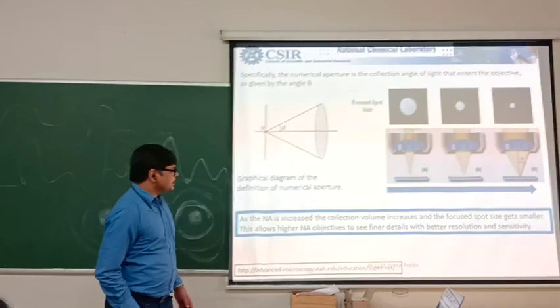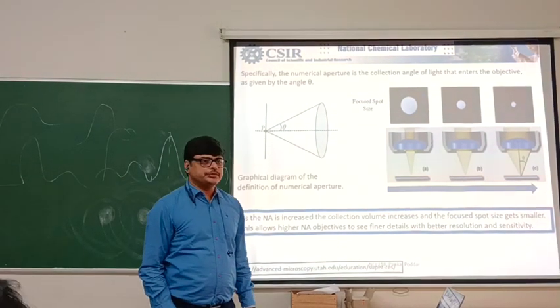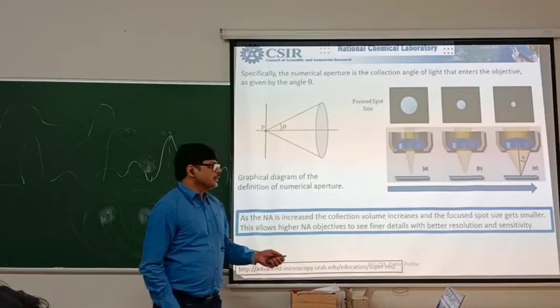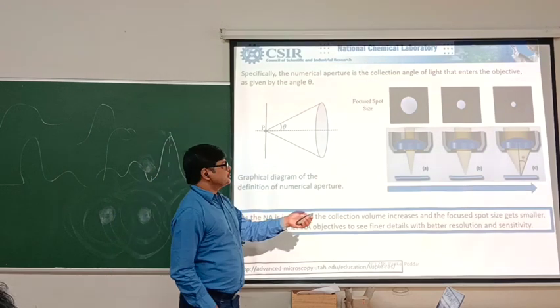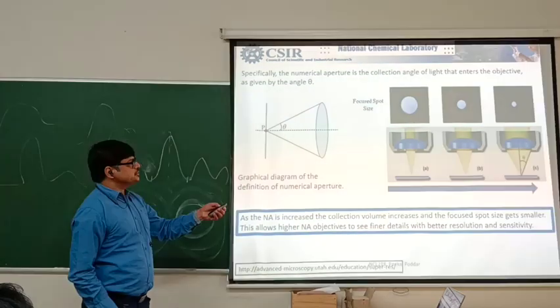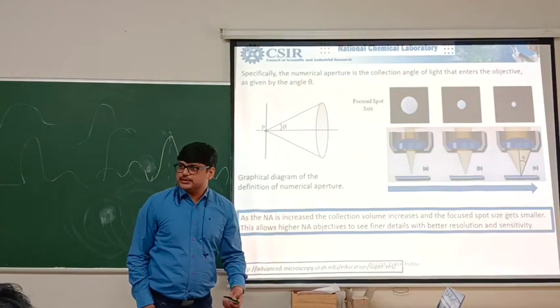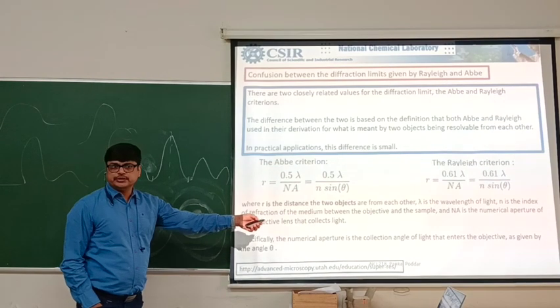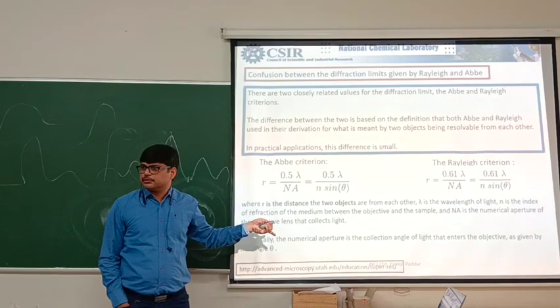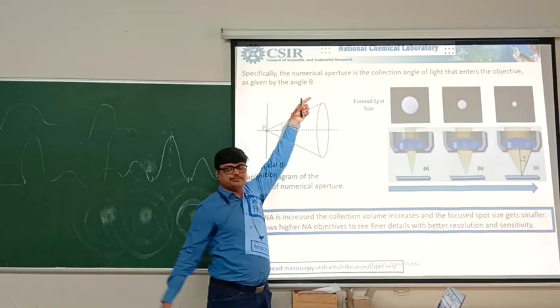So, for example, when you do Raman spectroscopy, you have a choice of using different apertures, for different magnifications, so a different depth of field. If you change this aperture size, the collection angle, then your resolution gets better. When you are increasing this, your R becomes smaller, and smaller is the better number. But you cannot infinitely increase this. You have to make big lenses, right?